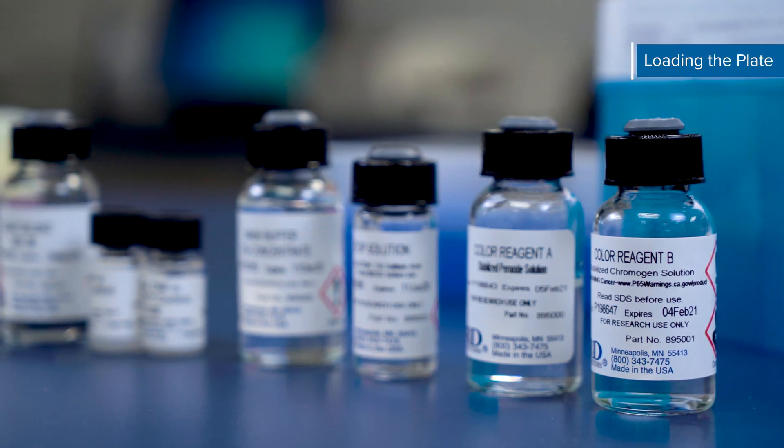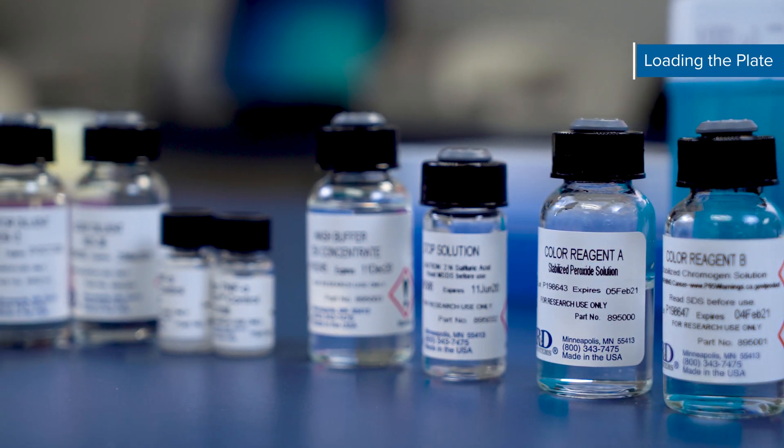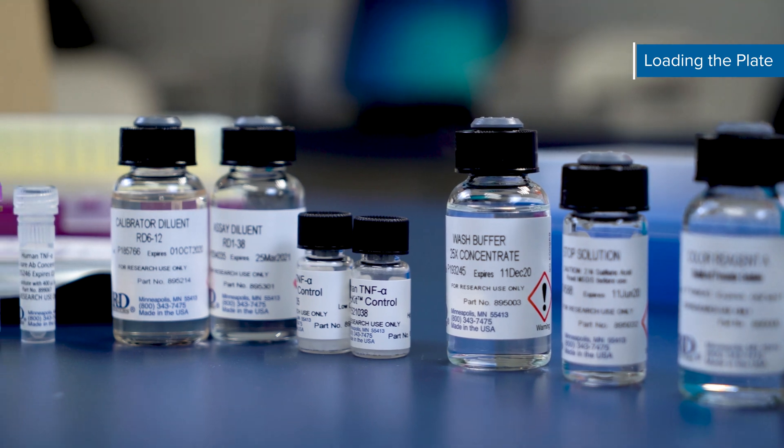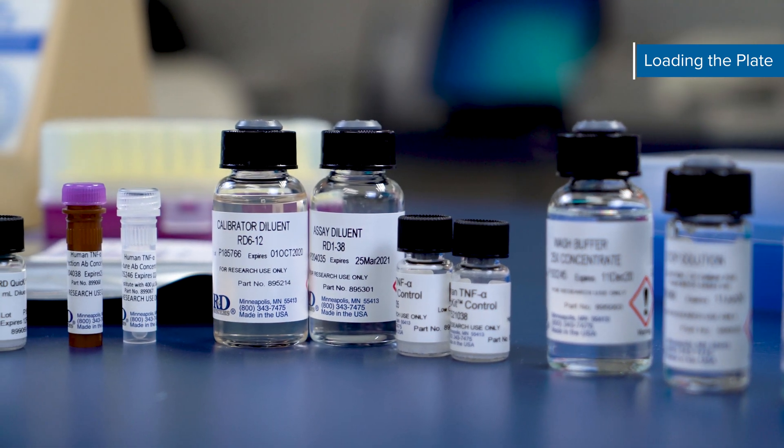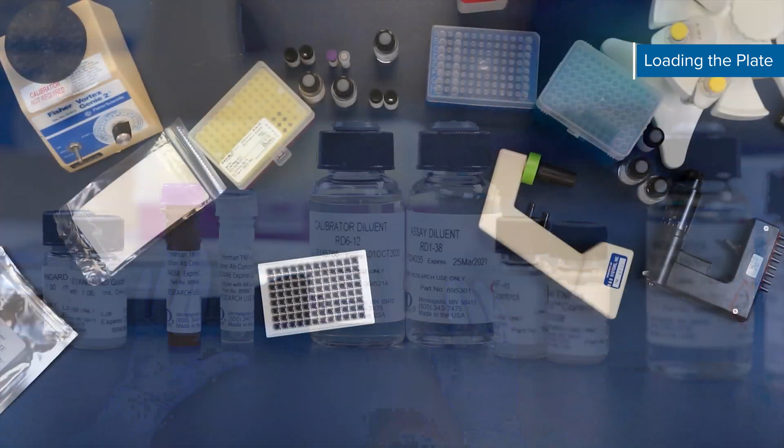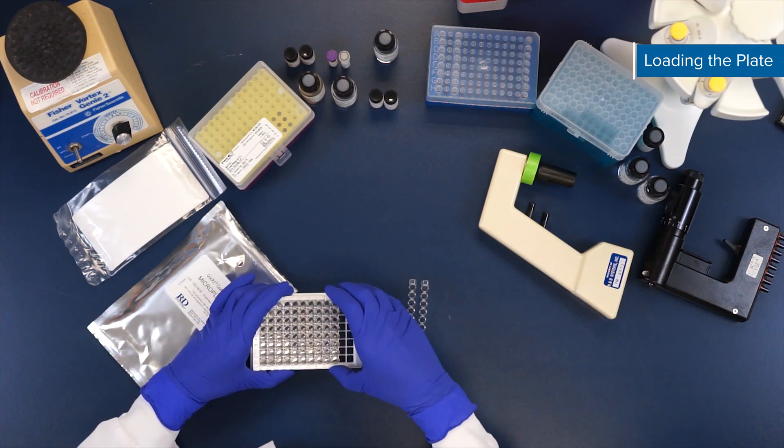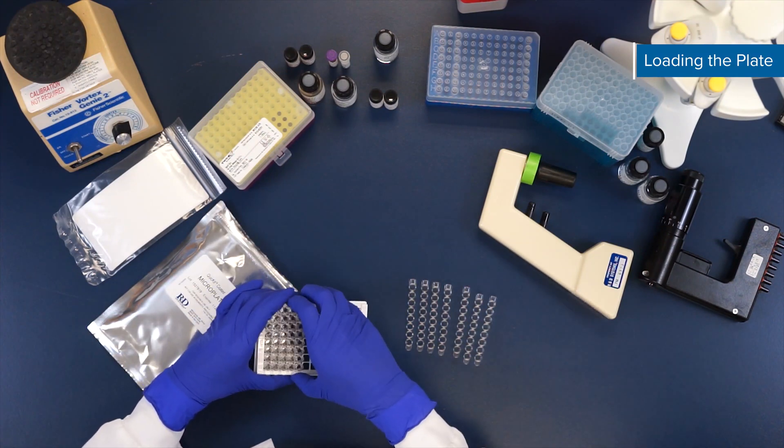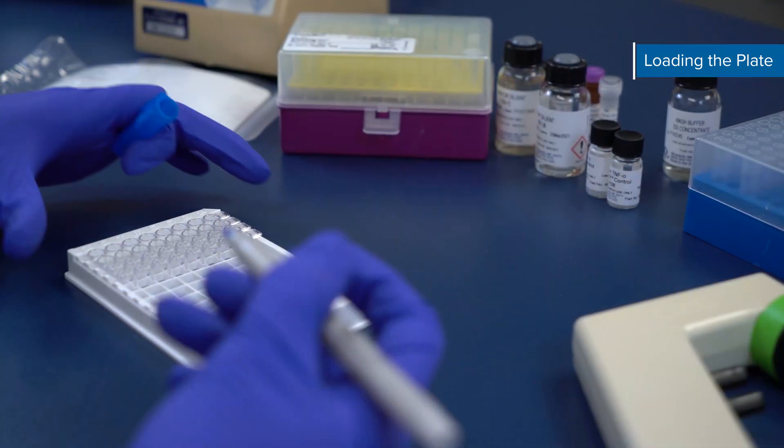Once you've prepared your samples and reagents as directed in the previous sections, it's time to run your QuickKit ELISA. We recommend that all samples, controls, and standards be assayed in duplicate. Remove excess microplate strips from the plate frame, return them to the foil pouch containing the desiccant pack, and reseal. We recommend labeling your plate strips.